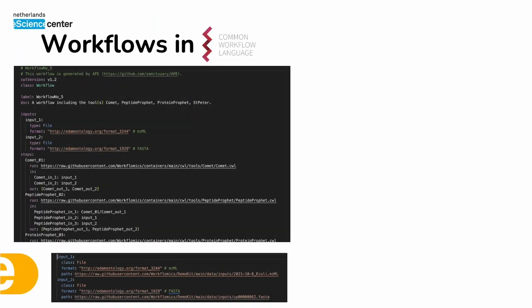Once the user downloads the files locally they would get a CWL file per workflow. And each of these would consist of a header, list of inputs, list of steps where each step corresponds to a tool visualized earlier as part of our workflow, and the list of outputs.